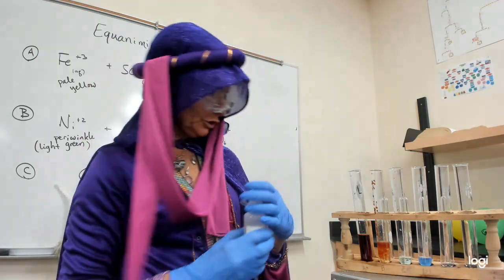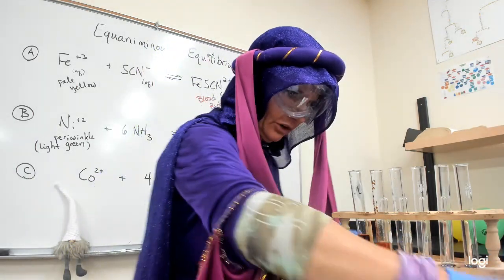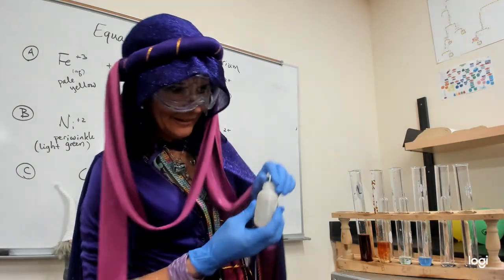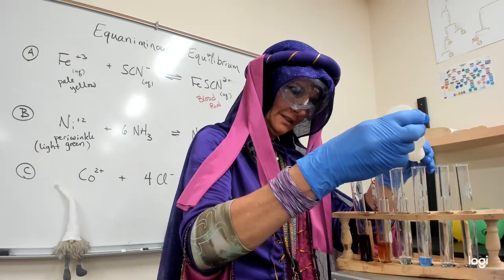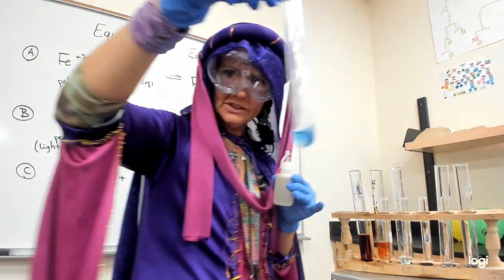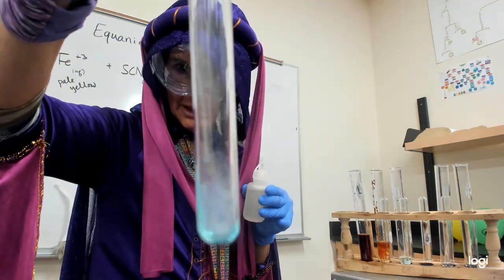Now, I didn't ask you the question this time about that. We're going to add some HCl. Now, you might be going, HCl? That's not part of it. Nothing's going to happen. I'm going to add it. Let's see. Just need a few drops. Ooh, that's pretty cool. There's like this effervescent smoke. Do you see the smoke?